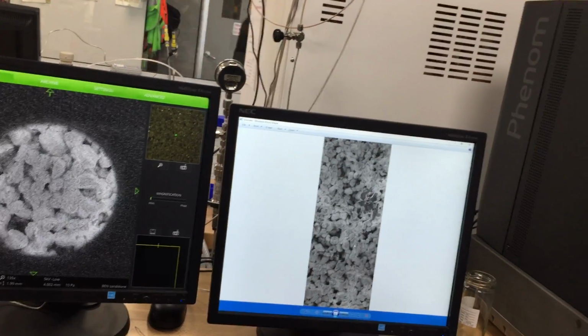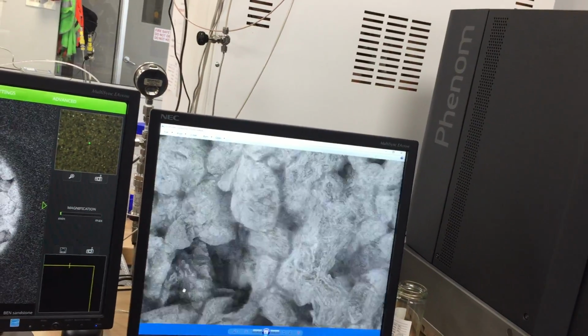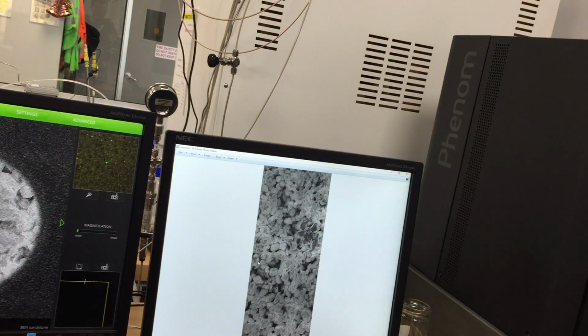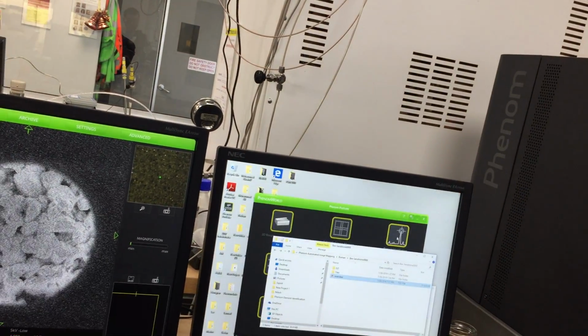But the actual overview, the finished image, is this. Okay, that's cool. But the stitching, even in some areas, is not perfect. But you have a good overview of what it looks like. So is it finished now? Yes, finished. Okay, and let's do EDS.